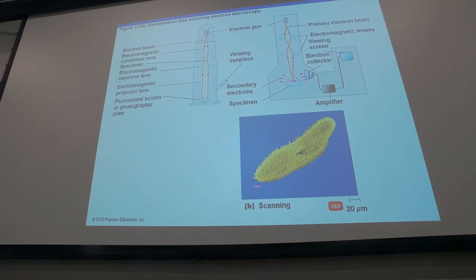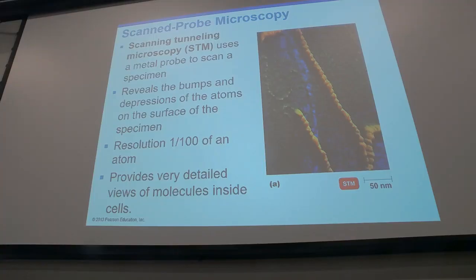It's the same as before that we have seen over and over with the different microscopes. But with this paramecium, now you can see the surface. You can see the little peeling, so it looks like a shaggy surface. The same deal: it has an electron gun, collectors of electrons, amplifiers, and sends this image to software, and then you can enhance the color with this software. It does not necessarily need to be coated with gold. Gold is an example. They can use different salts.